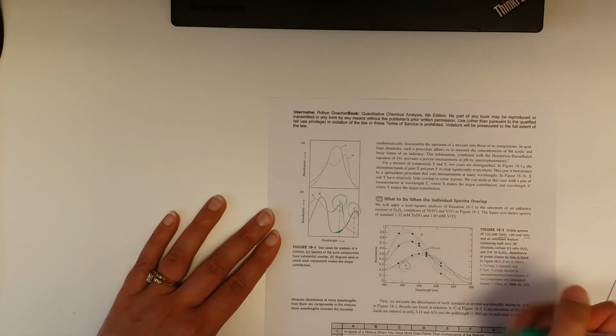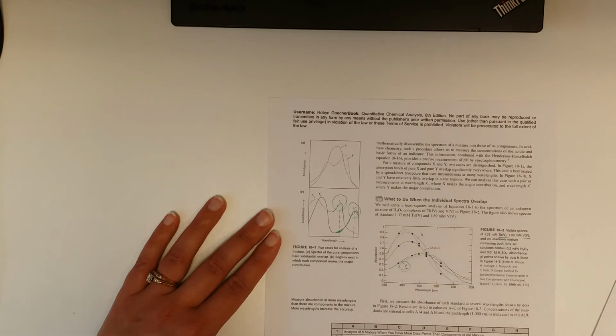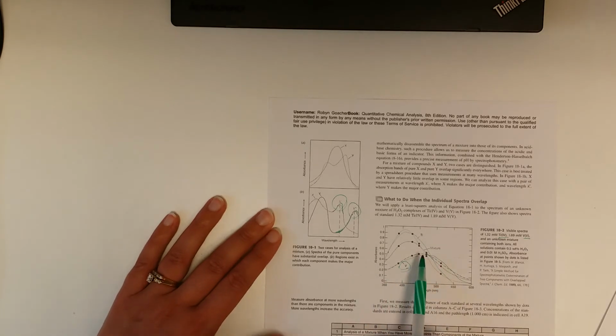Titanium looks like that. And the mixture of the two is really hard to tell apart. So just like before, you're going to scan one standard alone, one standard together. I'm telling you about this because there's a homework question. And this is a really powerful thing.